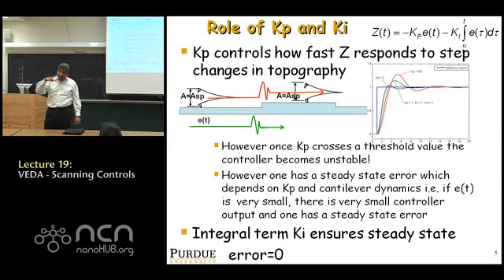However, as soon as you hit this edge, the amplitude is going to suddenly change because there's less room for the cantilever to vibrate. Suddenly there's less room, so the amplitude changes. As soon as the amplitude changes, it's different from the set point amplitude. So the error signal changes, shown in green, at the edge. The controller moves up and down to try and keep the amplitude constant. During the transition process, you see this non-zero error signal at the edge of this object, after which it stabilizes and everything is okay. Okay?